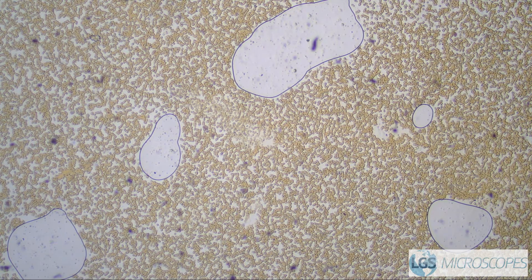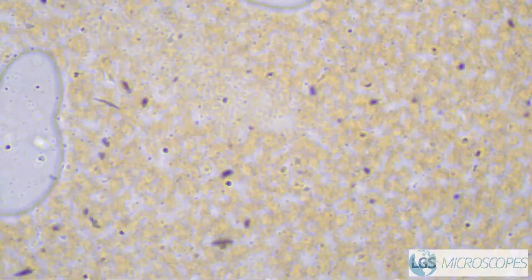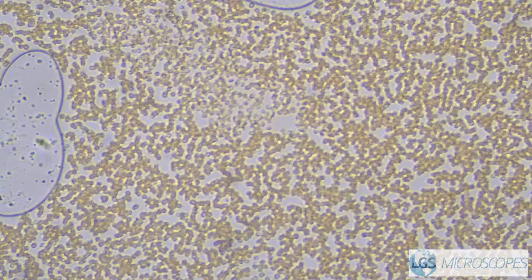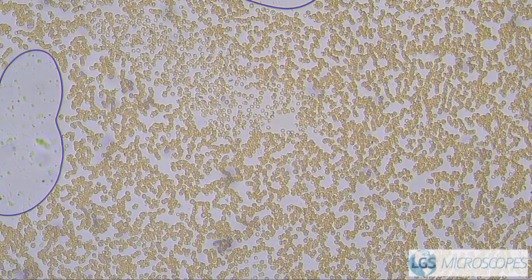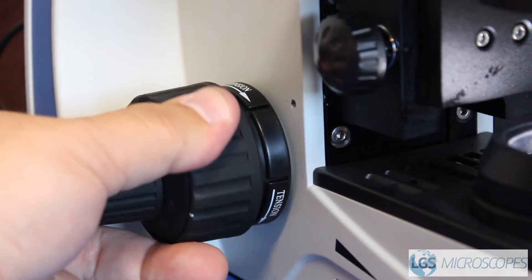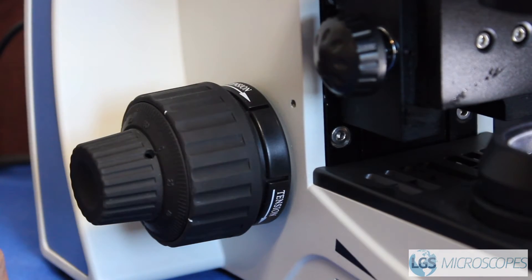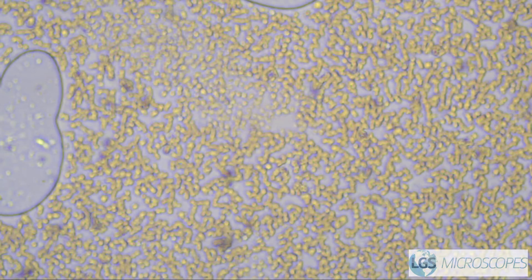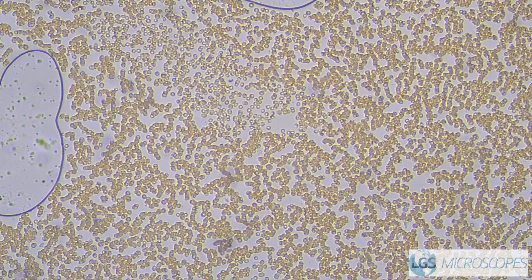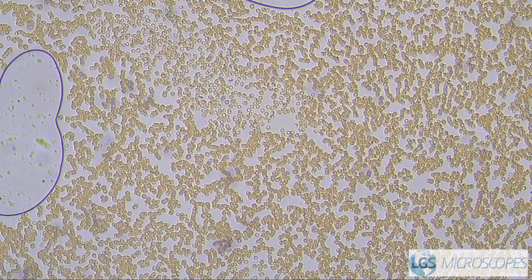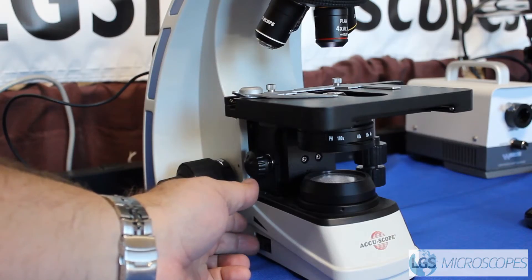Once you've found what you need on your 4x objective — which is the lowest one — then you can go ahead and swing around to the 10x. You're going to zoom in a little bit more and you might need to do some fine adjustments on the focus. Find what it is you're looking for again. You can also adjust the light accordingly if it's too bright or too dim.